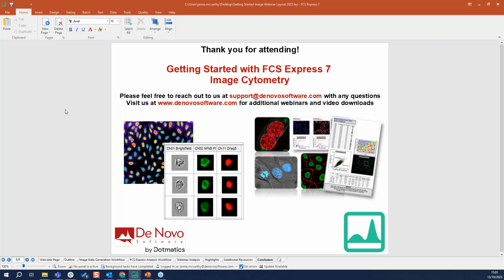So I'd like to welcome you to the webinar for getting started with image cytometry. My name is Jamie McCarthy, and I'm a technical application specialist with de novo software. I'm really excited to be hosting this webinar for you today, so I can show you some of the things FCS Express can offer for our users.